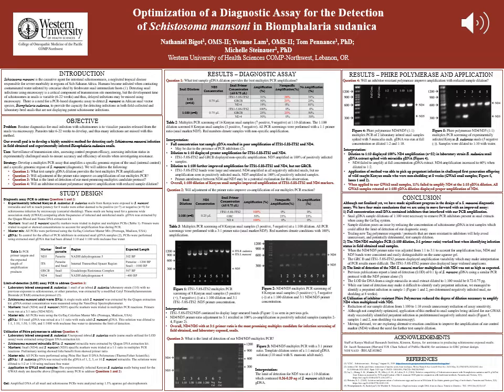11% of the samples did not amplify our control marker at the 1 to 10 dilution, but this was resolved at 1 to 100 dilution. Although the assay needs further optimization, we successfully identified pre-patent infection in negatively infected snails. Moving forward, we are exploring alternative conditions to improve amplification of our control markers without the need for further sample dilution. Thank you.